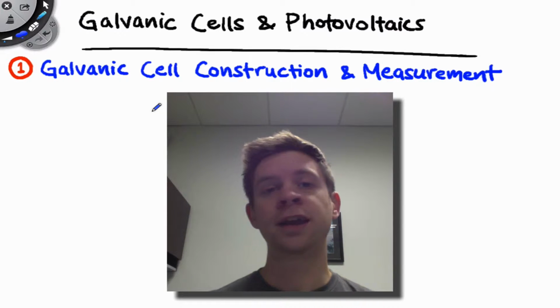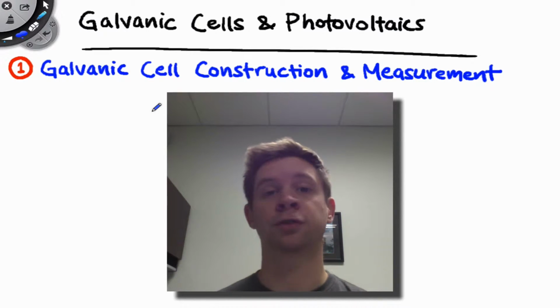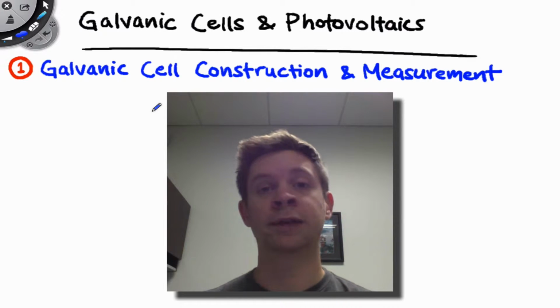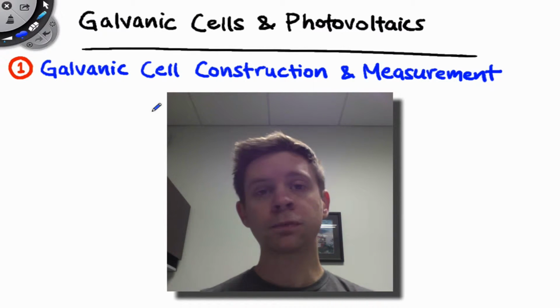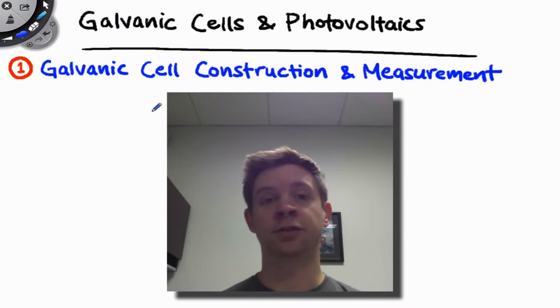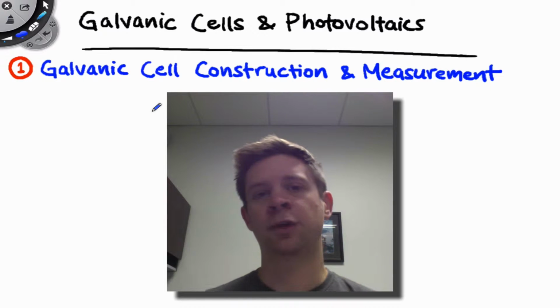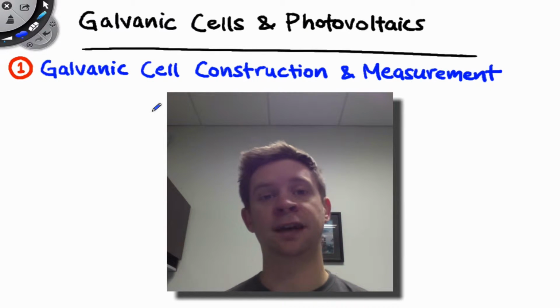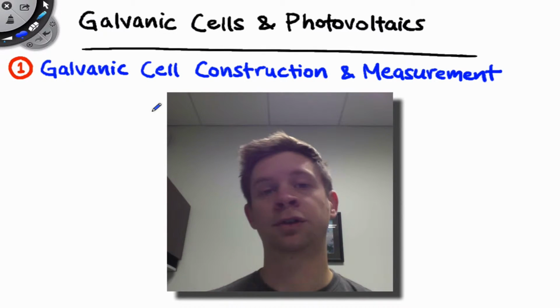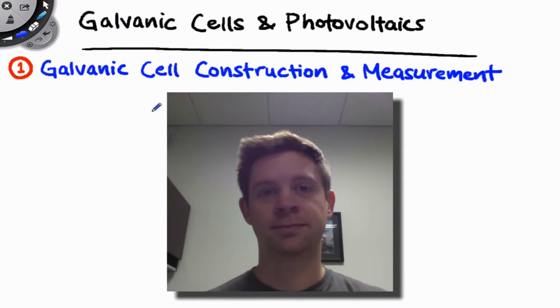And in the photovoltaics part of the experiment, we're going to see how chemical energy can be used to convert solar into electrical power. So solar power is going to excite a colored molecule. That excitation is going to be converted into a voltage and a current that we're going to be able to measure across a solar cell. So it works much in the same way as photosynthesis, actually, in that the light harvesting molecule is excited and its energy is transferred into some other purpose.